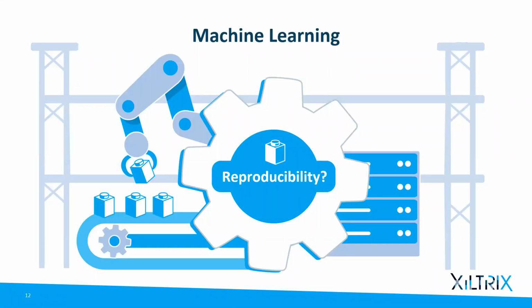If you put all of that information into machine learning, it will probably be able to detect a certain pattern. But if you then try to copy that pattern into devices of the same brand within the same lab, you will already see differences. If you try to duplicate those patterns on different devices, different types, different brands, you will see that it's almost impossible to reproduce.